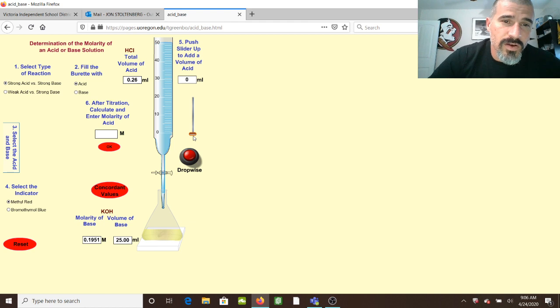So if you go and throw in 15 milliliters in one time, you might blast past that point. What we're trying to do is get as close to that balance point, that neutralization point, as possible to get as accurate of information as possible. So I'm just gonna, let's add 5.